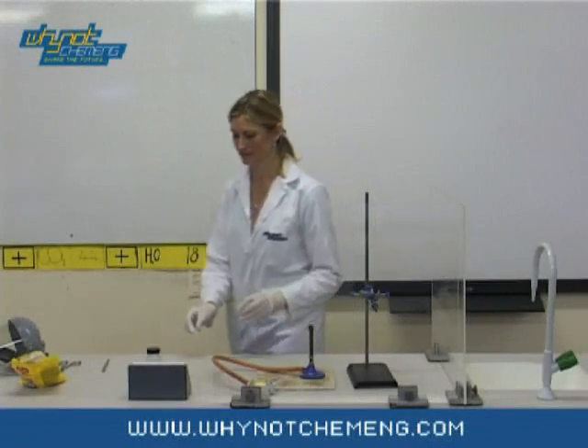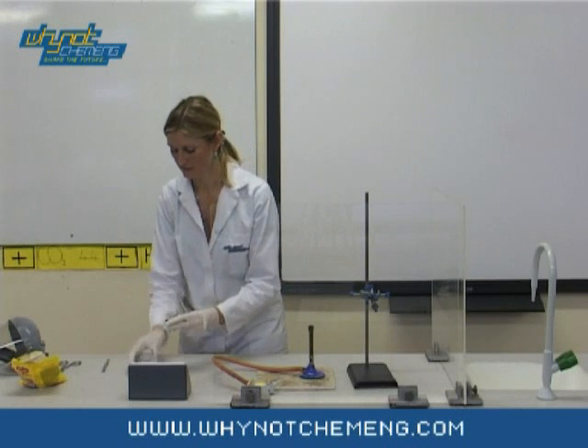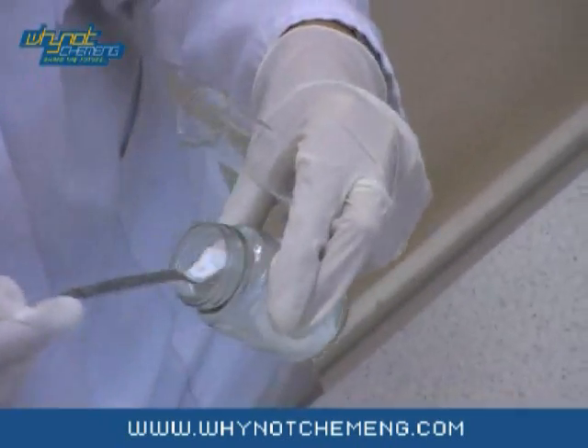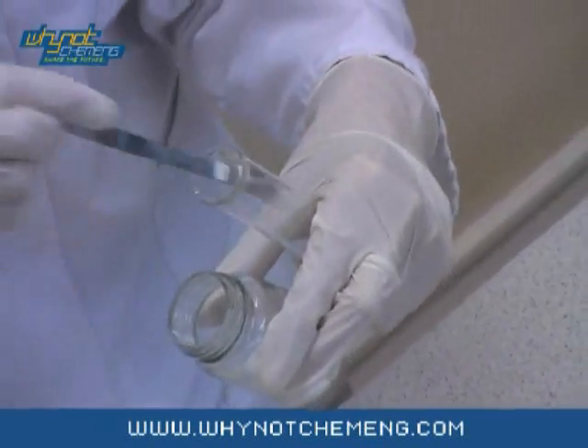This demonstration involves putting a Jelly Baby into molten potassium chlorate. First, scoop 7 grams of potassium chlorate into a boiling tube. Don't be tempted to use more than this — this is the amount recommended by the National Science Learning Centre.